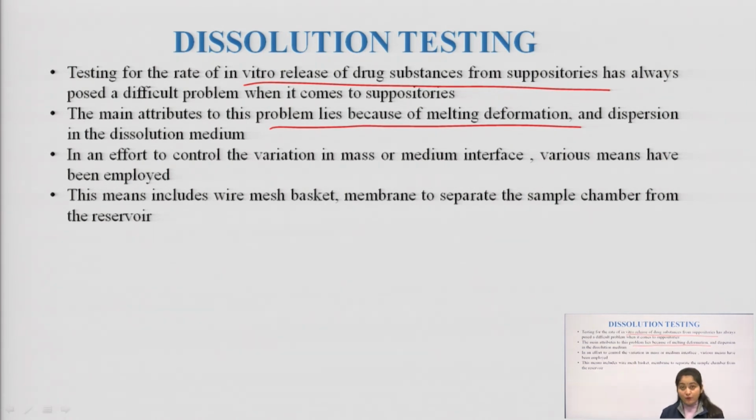It is actually a problem, because initially the suppositories have already lost their shape or deformed, so we can imagine a certain amount of medication has already melted. So some amount of drug has already been lost initially. In order to cope with this and study dissolution, there is definitely a big challenge for all of us. So dissolution testing is actually a challenge.